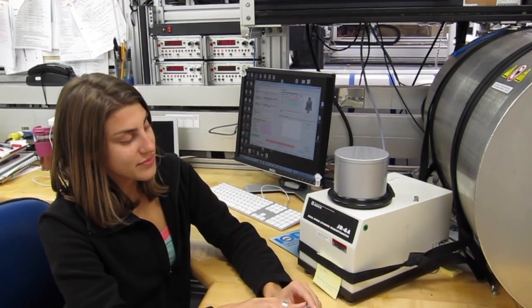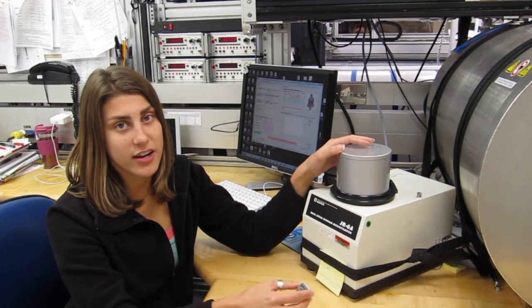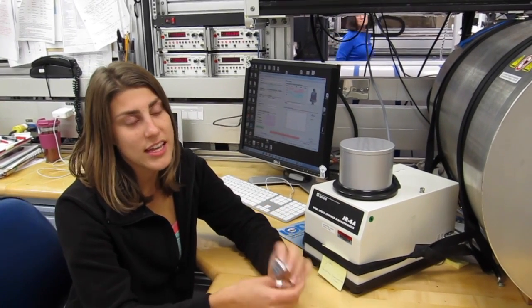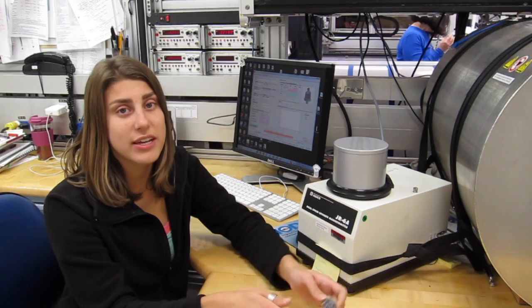First we measure them on the magnetometer, and this tells us the natural magnetism that it reports. Sometimes this has been overprinted or it picks up a new magnetization from the drilling process.